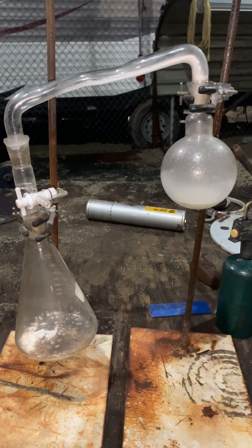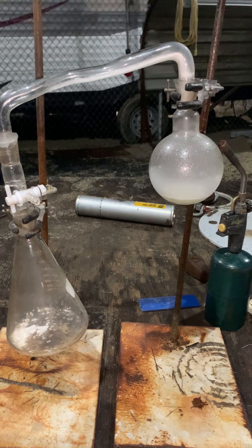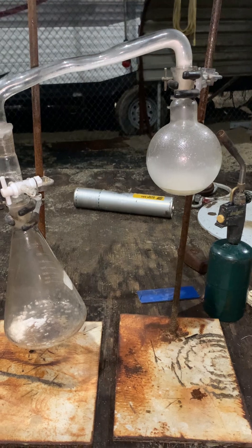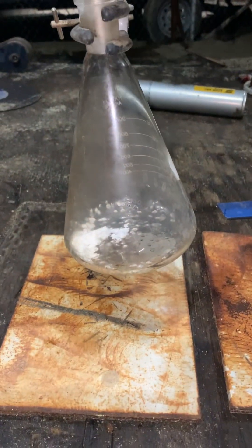I have something interesting to show everybody. I've already done it here, but in that boiling flask there was — or is — sulfamic acid. It's just a simple retort setup. And I do believe what we have there is sulfur trioxide.